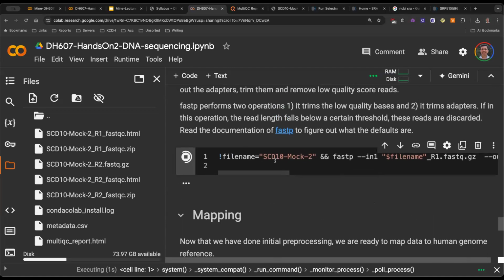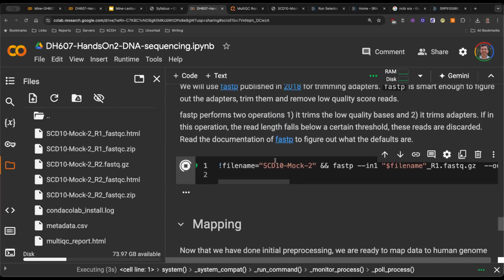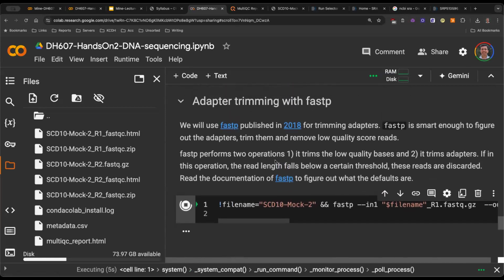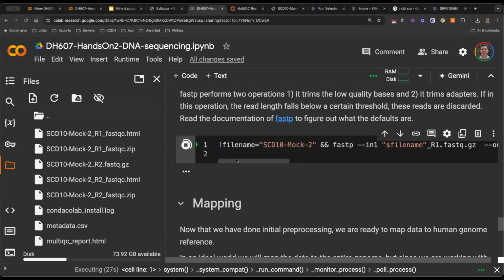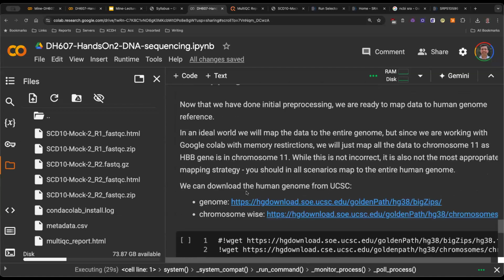And this is another tool called FastP, which is actually very fast, and it removes the adapters and does some quality trimming for you also. I don't keep quality scores which are less than 10 in your data because you're not really confident, so you just chuck them out. And you can do this easily because they're anyway going to be towards the end of your sequences. So FastP will run hopefully quick.